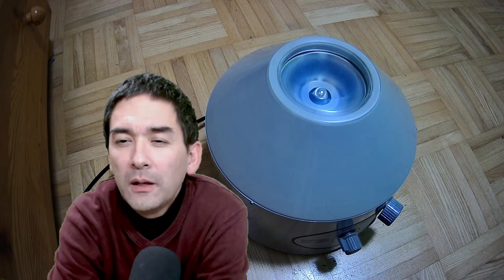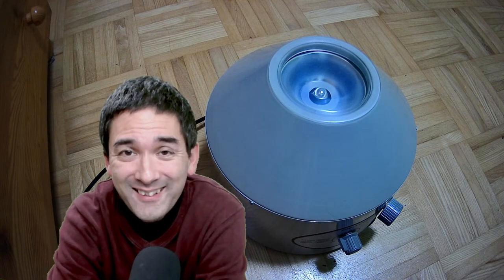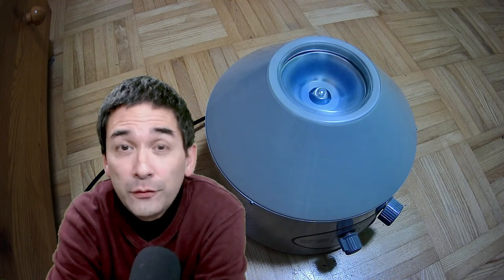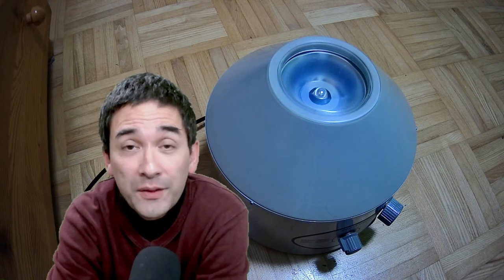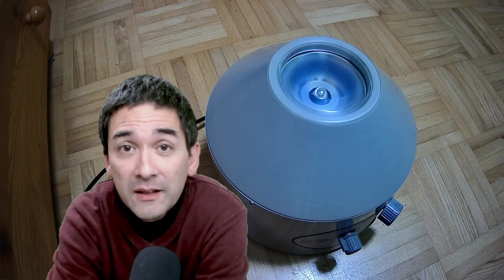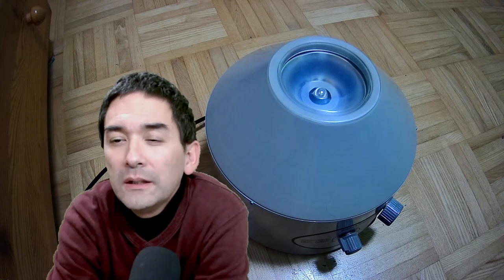Question: will vibration of the centrifuge also happen if you use a hand centrifuge? With a hand centrifuge the spinning speed is not as high — far fewer RPMs — and therefore the forces are much lower. The faster the centrifuge spins the better it has to be balanced because the forces are really high. With a hand centrifuge the tolerances are much higher.